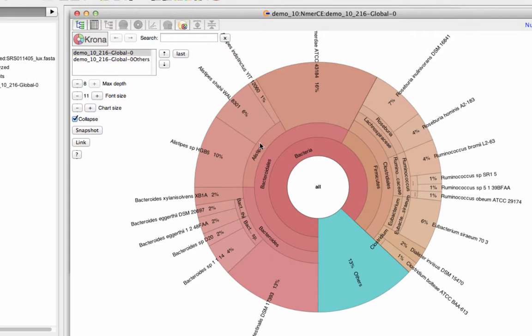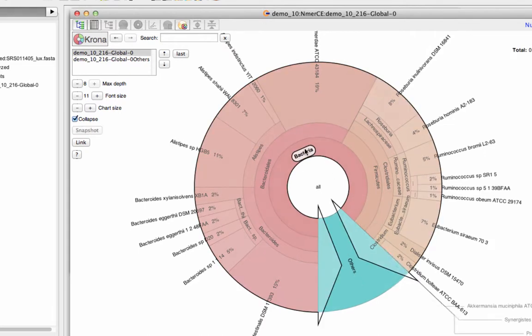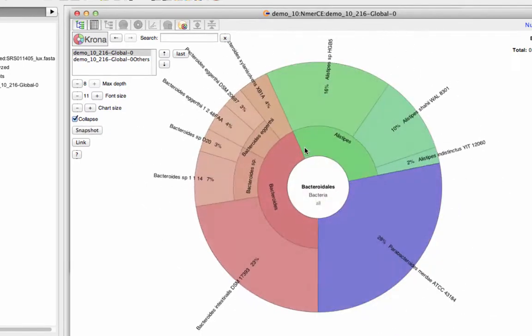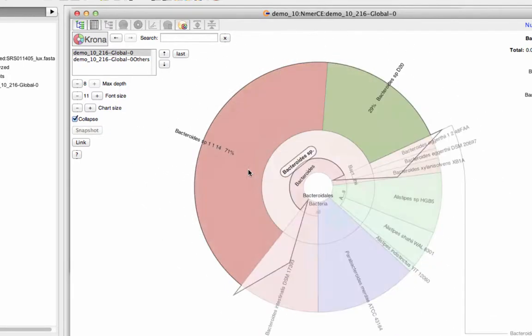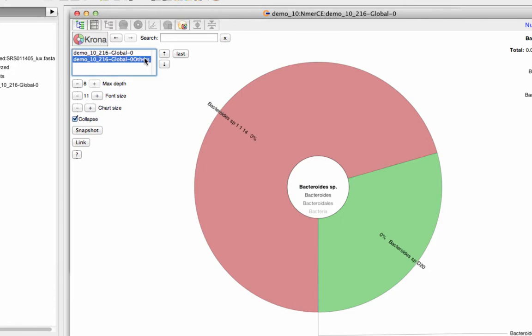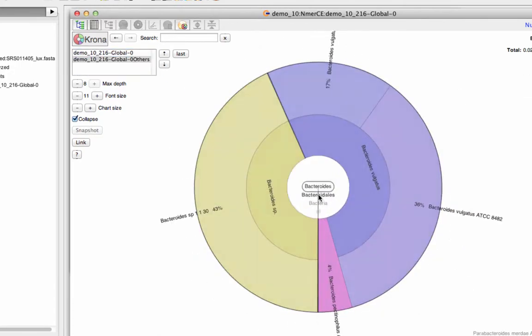In Genius, there are multiple ways to visualize your results. One example is Crona, an interactive dynamic pie chart that allows you to focus on taxonomic groups that you are interested in and see the relative distributions of all members within the group.